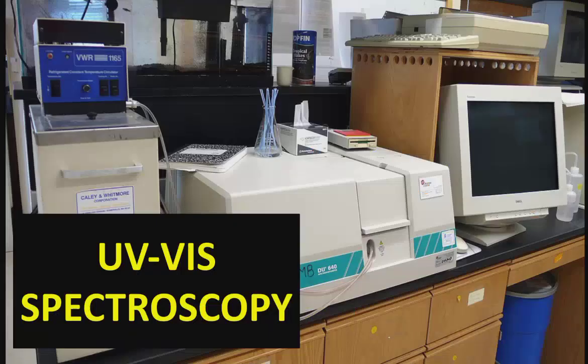So today in this lecture we are going to start UV-VIS spectroscopy. So what do you understand by UV-VIS? UV, we are all aware of this term, is ultraviolet, whereas VIS is visible. Today we will study ultraviolet visible spectroscopy. In the previous lecture we already covered infrared spectroscopy.